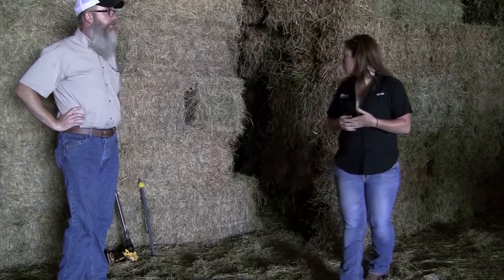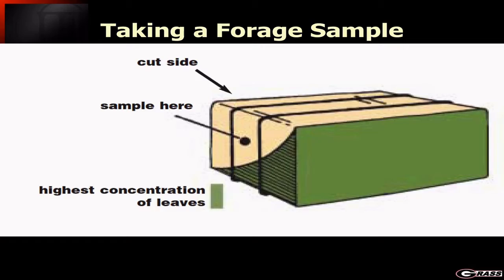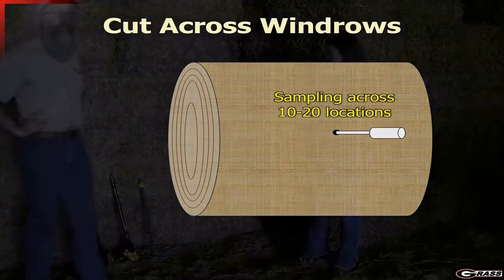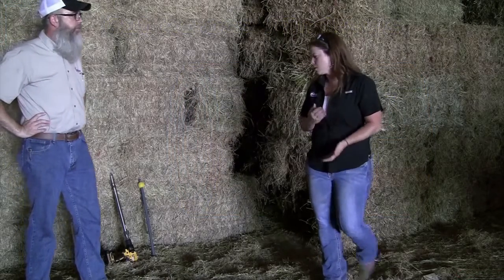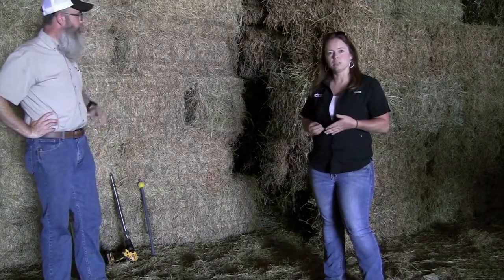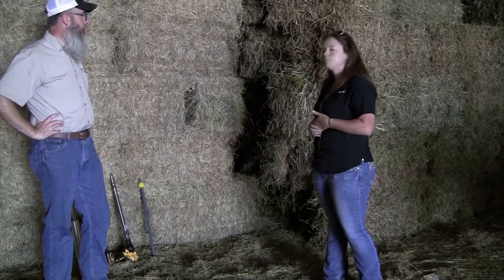And like Dennis was showing you earlier, you do want to make sure on your square bales that you're going to go in from the short end, and on your round bales you'll go in from the curved side. Make sure that you insert the sampler, whatever type of probe you use, whether it's a Colorado probe or a Penn State probe, fully into the bales so that you get a very thorough cross section. And again, make sure that you're crossways to the stems on the bales, which is going to be the short side of your square bales and the curved side of your round bales.